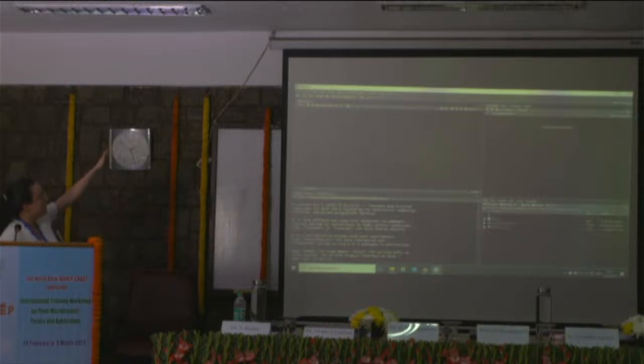Then, on the left down, we have the console. The console is the one that executes everything. And as soon as you execute something that you had written over there, you will see it in here. So, for example, I think you can see the letters. I hope you do. If not, please tell me. If I have 2 plus 2 written in here, it's not being executed right now.